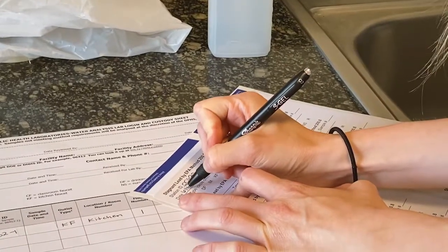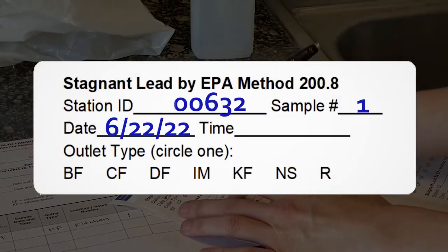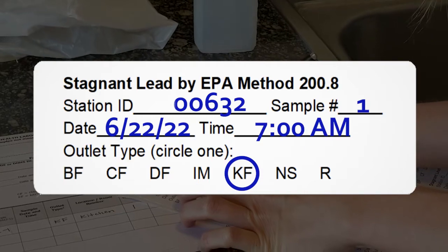Starting with the first outlet you plan to sample, fill out the provided bottle label with the appropriate station ID, sample number, date, time, and outlet type. Make sure the chain of custody matches the information collected during the outlet inventory.